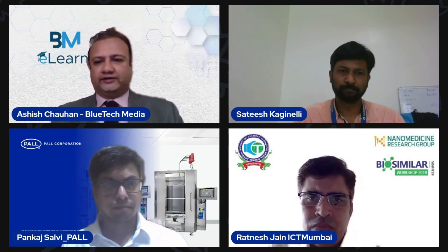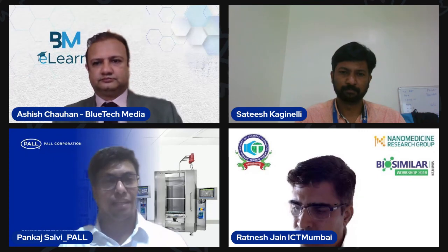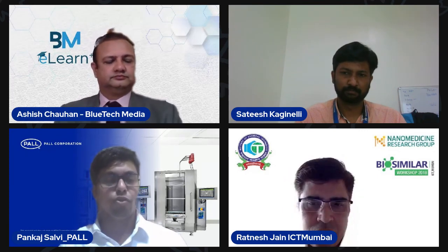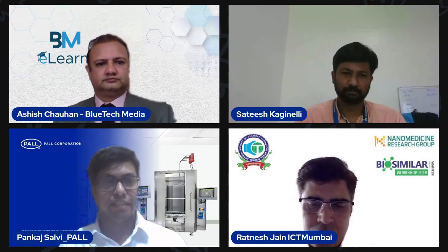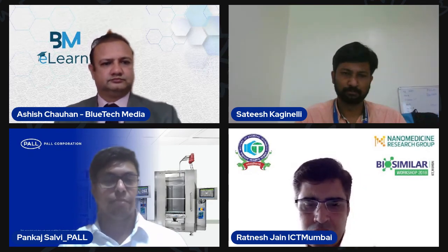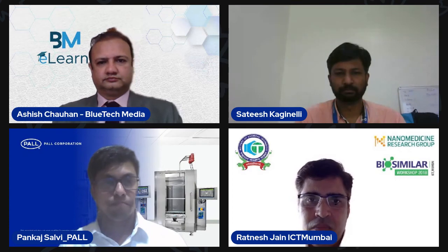Okay. There is one more question for Mr. Pankaj. Which engineering parameter should be critical during process scale-up from cylindrical geometry to cubical geometry? I guess I already answered that in my presentation. That wouldn't differ actually, because a cubical and a cylindrical essentially are the same. A cylindrical would always have baffles, so internally a cylindrical bioreactor would be similar to a cubical, cubical being a natural baffling system. Additionally, the parameters don't vary when you're going to scale it up. It would be essentially the same. You can consider kLa as a primary factor, the mixing time, and then kLa would be like a predictive model based on your superficial gas velocity and your power input per volume. And apart from that, there could be some other parameters which we need to work on.